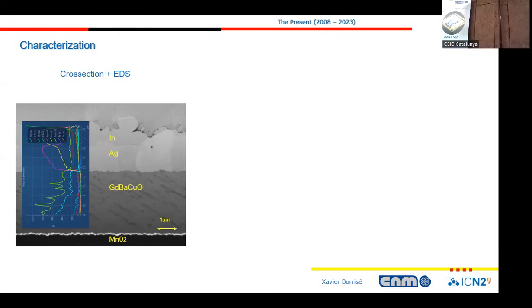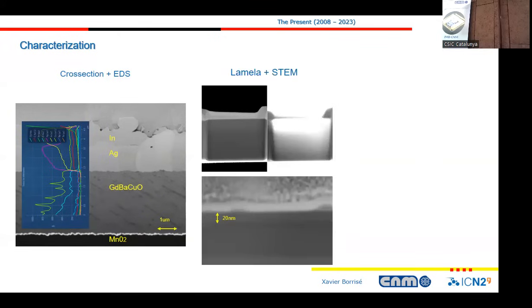Or we include an STEM detector, which is scanning transmission electron microscopy, meaning that we have a very thin layer of a material that we can prepare inside, as if you go to the TEM, transmission microscopy, but then we work at 30 kV. So we can have quite a good resolution, up to a few nanometers. So that's very good for characterization.